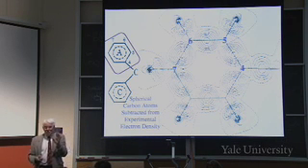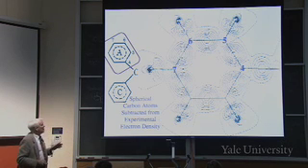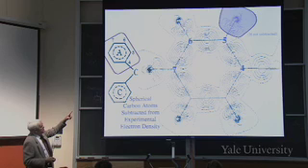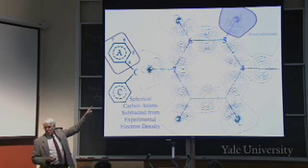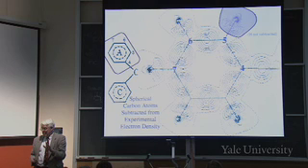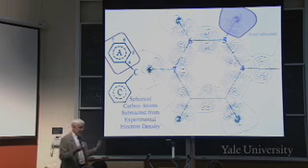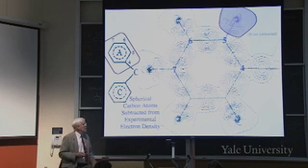So let's look at the features that are big here. This is how the electron density changed in forming the molecule from atoms. Okay, so first look up there. There's some very dense contours right in the middle up there, and that's the hydrogen, which was not subtracted, right? So it's the biggest game left in town once you've subtracted the spherical carbons.